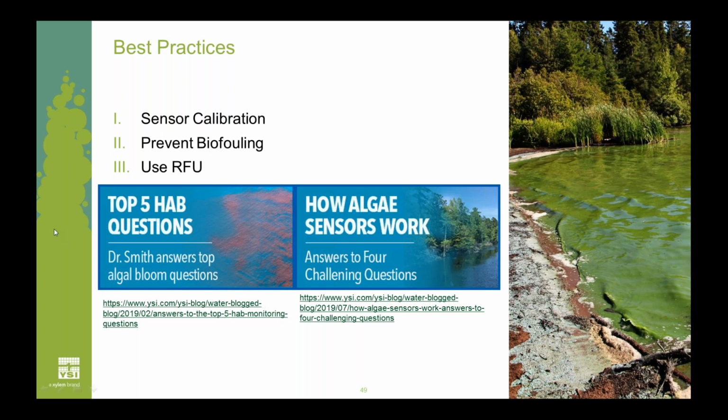I've done a lot of webinars about algae monitoring where I discuss a lot of ways to look at and interpret the data. We all love to talk about the finer details, such as different types of chlorophyll, A versus B, whether the sensors pick them up, temporal and temperature effects in environmental monitoring. That's something people should be aware of. Which pigment channels would give what outputs for an algae bloom?